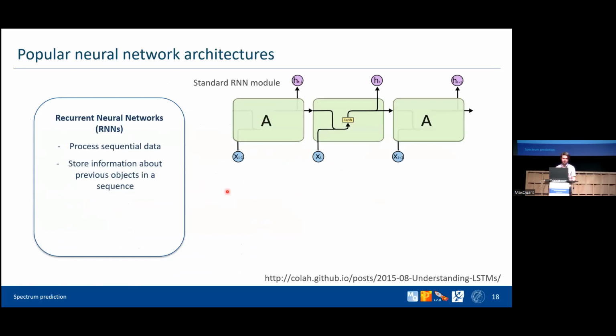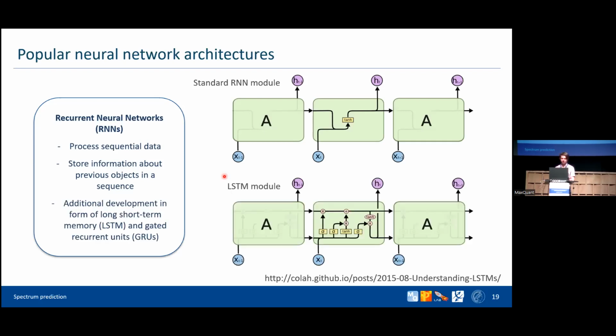Recurrent neural networks, or RNNs, are designed to process sequential data, and they can be applied to sequences of variable length, which makes them particularly useful for processing of peptides. Classic RNN models had trouble dealing with information spread across long distances in the sequence, which is actually important for peptides. But modern, more advanced models, such as long short-term memory and gated recurrent units, address this issue.